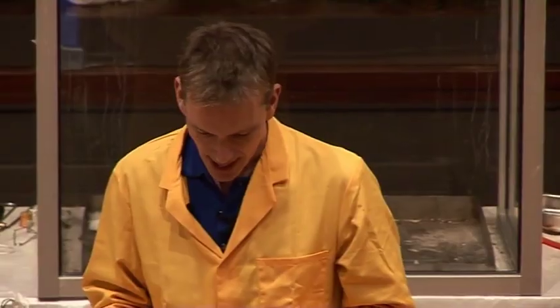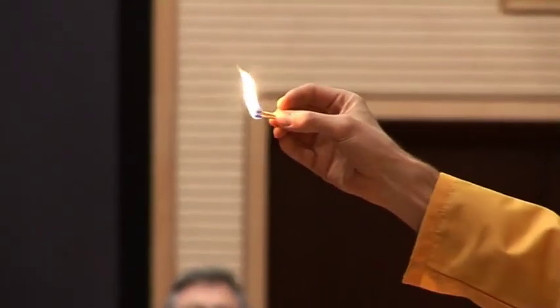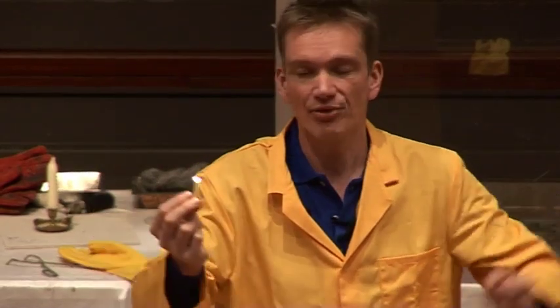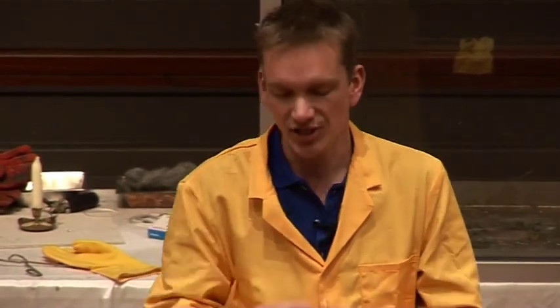The lecture is all about fire and flame and combustion. Here's a simple fire. These matches are burning quite nicely here. But what exactly is this? What is combustion? This is a chemical reaction that's taking place between the wood here and the oxygen from the air, and the chemical reaction is taking place with the liberation of heat and light energy.